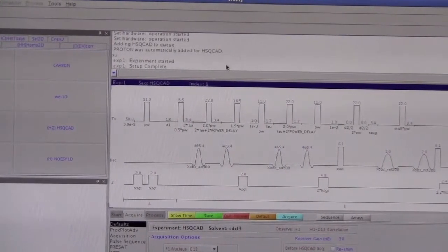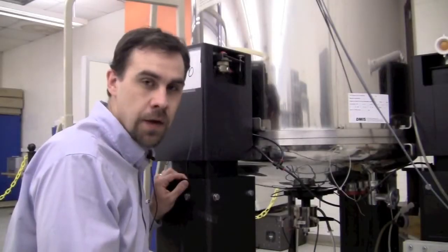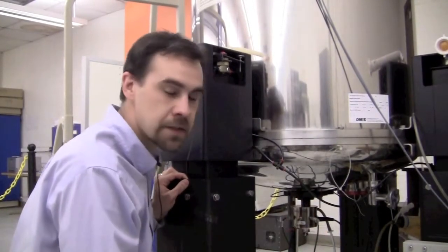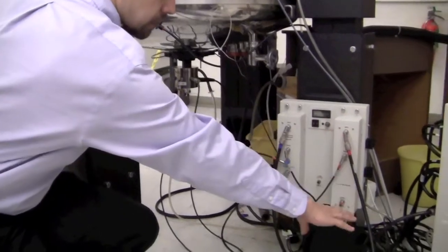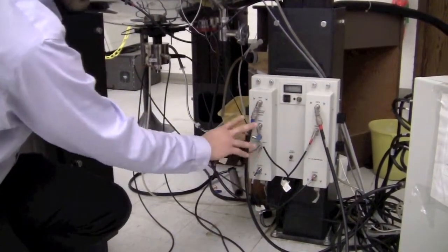Now we can go over to the magnet and continue the tuning and matching. With the software set up correctly, we come to the magnet itself. There are two channels: the red channel is the proton channel, and the blue channel is the X channel, which is typically tuned to carbon.